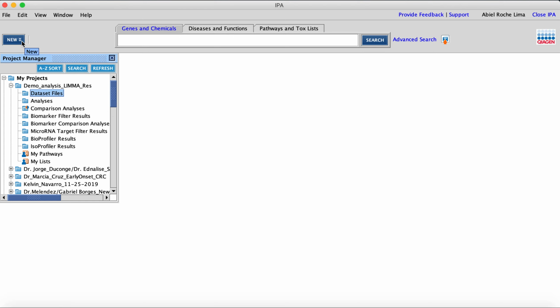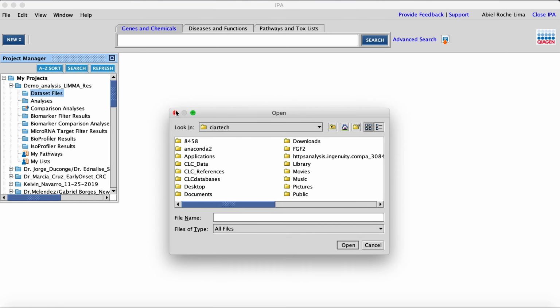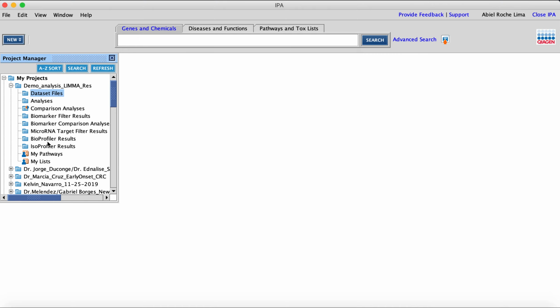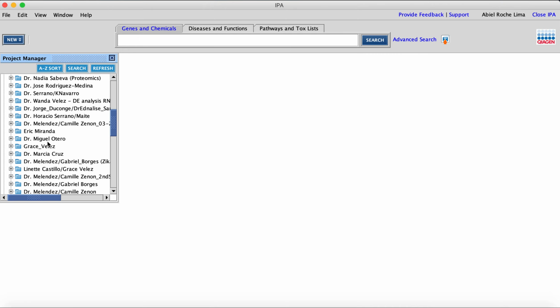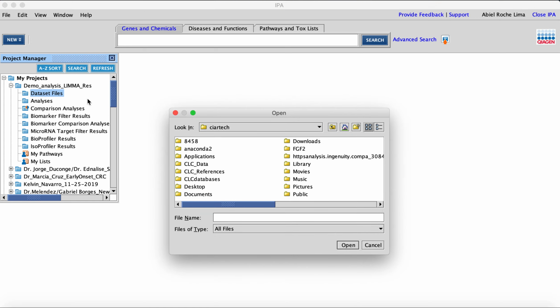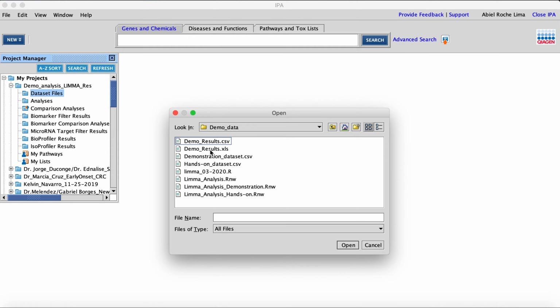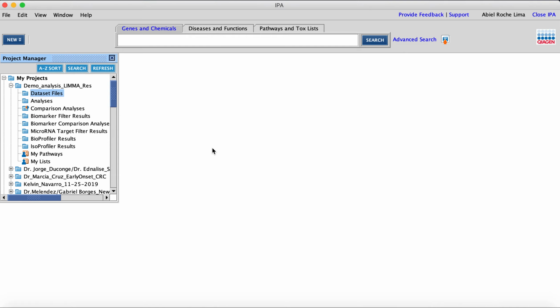If you do it in the other place, you need to specifically give which one of this list you want to submit the upload. So it's better to do Upload Dataset and then go to the directory where you saved your file, and we are already in the directory, so we're just double clicking it.